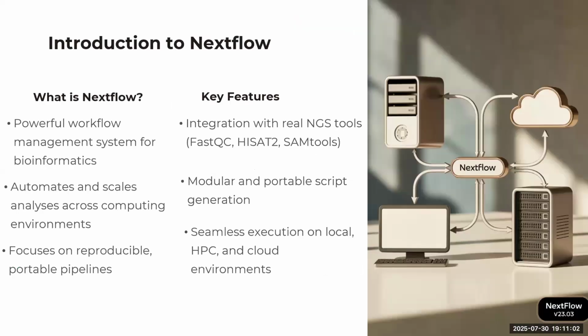Now we have talked about several of them. Let's make an introduction to Nextflow. So Nextflow, as we said, is the most commonly preferred, powerful workflow management system for bioinformatics. It is used for automation and scaling analysis across computing environments, making sure that we have reproducible pipelines.